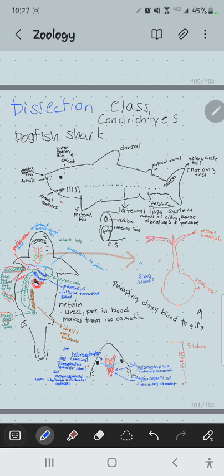Okay. So let's see here. Let me show you how this works. I'm going to go ahead. I don't know exactly what sharks I have in here, but I'm going to go ahead and open this one up and see. And I don't know what sex we have. Males have claspers, and the females don't. This looks like a good shark. There's one in here. So if you guys want to, Benny, you can bring that chair over. You might need some help there, some support. Or turn sideways. So like I said, I'm going to try to drain these out. And then this is a male, get a little closer, because it has these claspers, so you can show people the claspers. The females won't have the claspers.